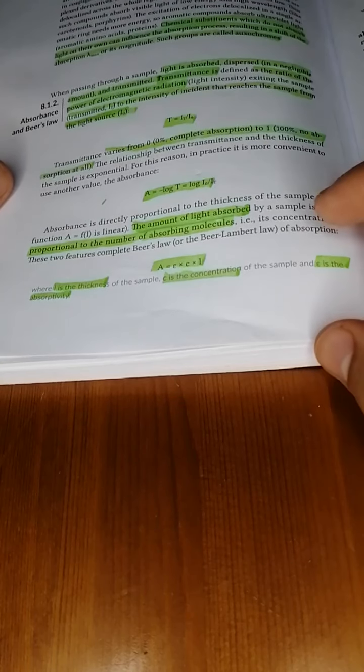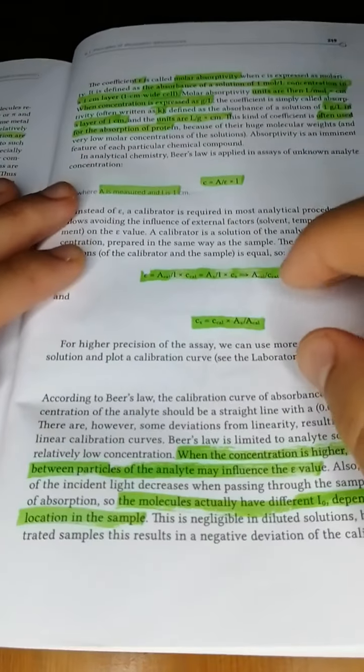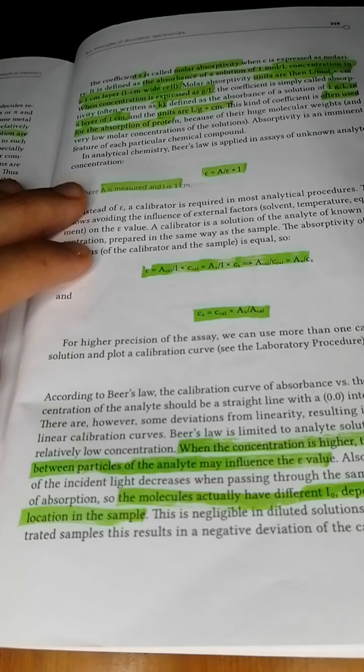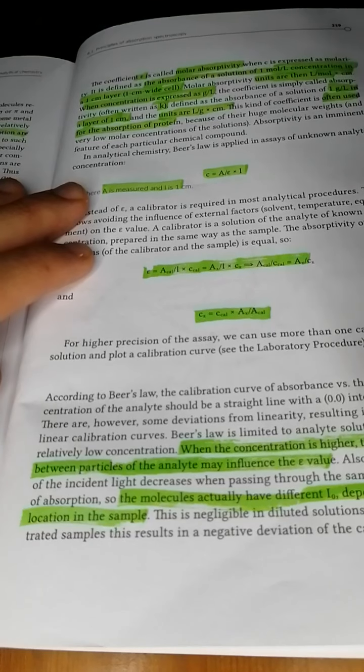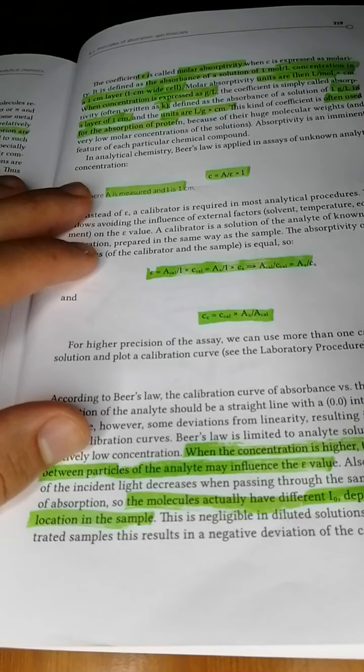Now we go on to something called Beer's law, and Beer's law is a function of absorbance. Basically what this says is the absorbance of a certain material equals the absorptivity. So what does absorptivity mean? Absorptivity is a constant for each molecule or substance, and you have two types: molar absorptivity, and just absorptivity, or the coefficient absorptivity. Molar absorptivity is ε, and coefficient absorptivity is k.